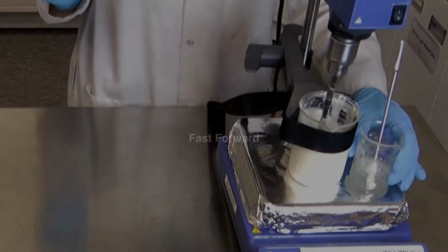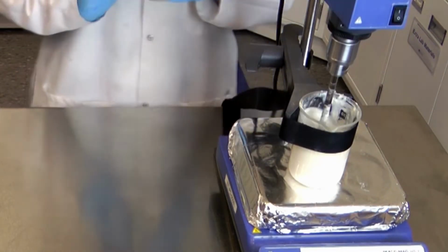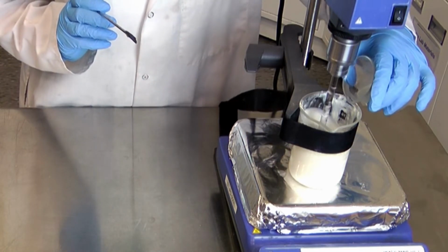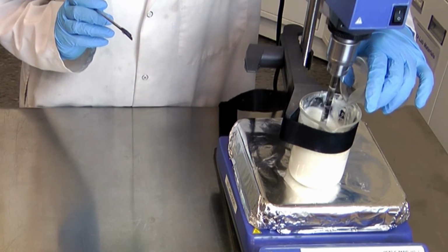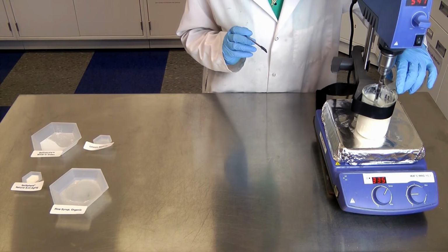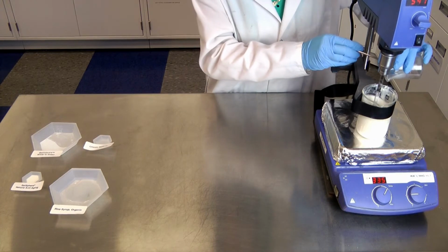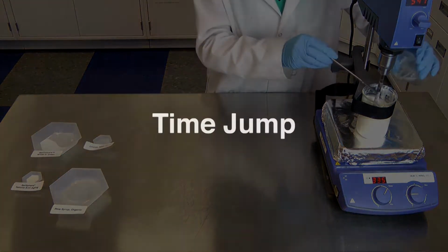Now that both the oil and water phase have reached an internal temperature of 70 degrees Celsius, we will begin to add the oil to the water phase. This should thicken the water a considerable amount, so the propeller speed will most likely need to be increased. And now we will cool this down to 45 degrees C to add the rest of the formulation.